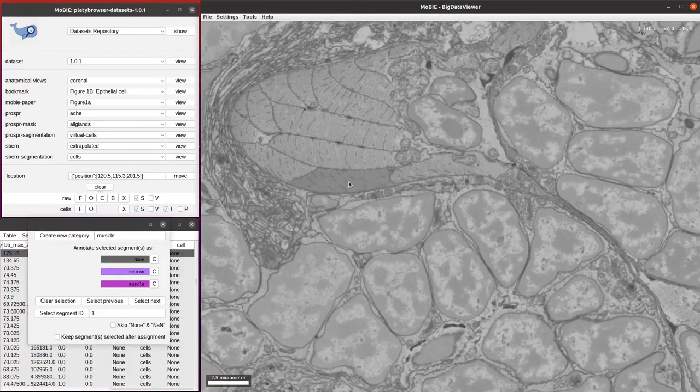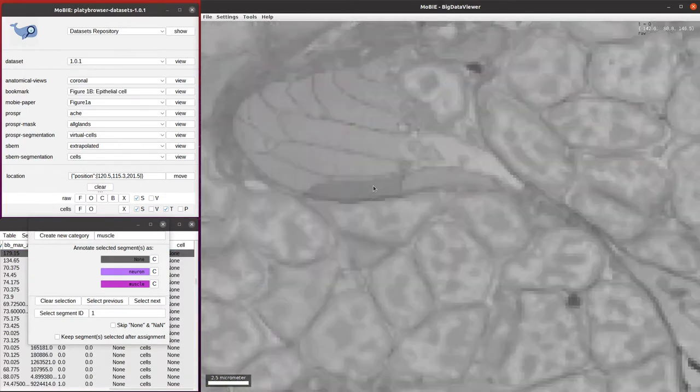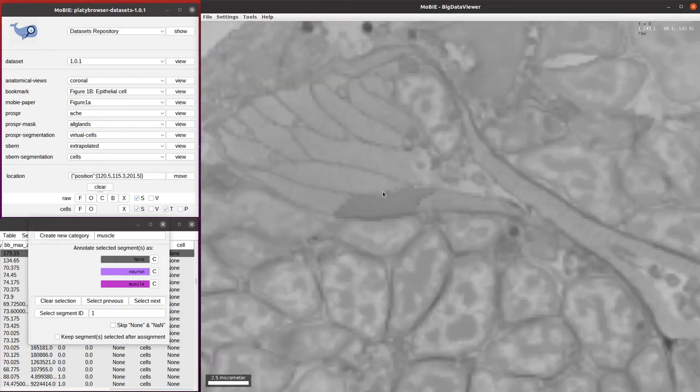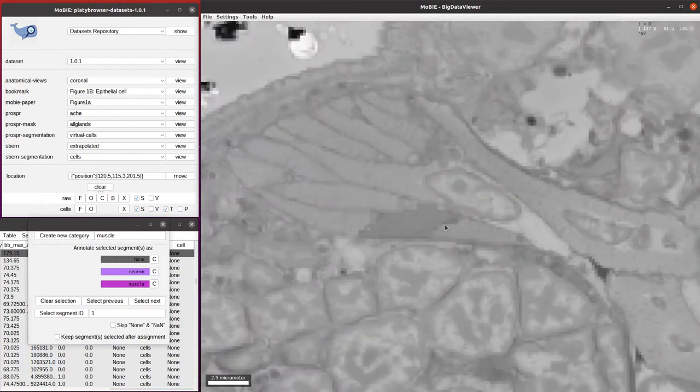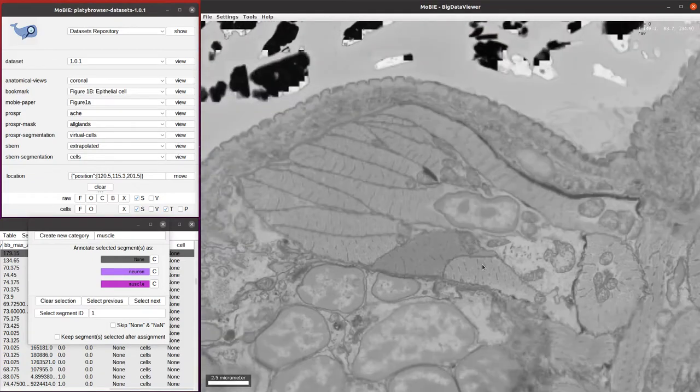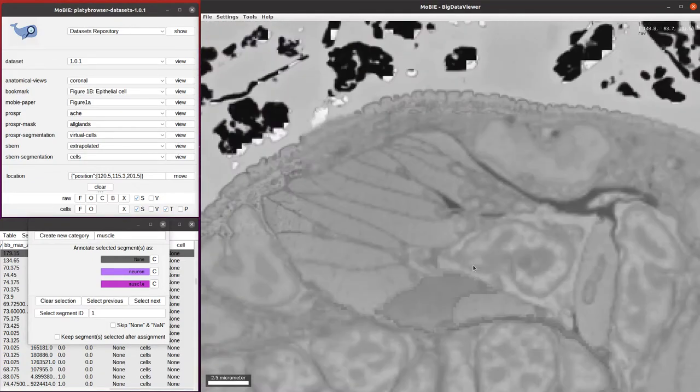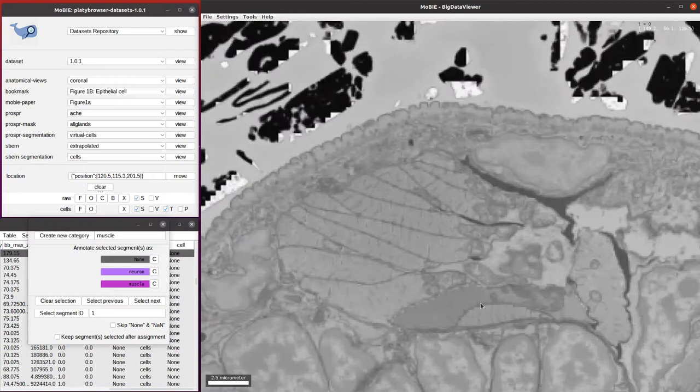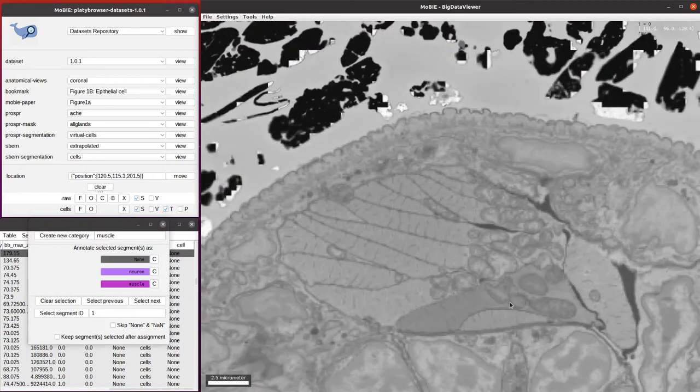If we scroll to another part of the dataset, we see we have a different cell type here. If I scroll through in Z, you can see it's a very long cell, quite a thin cell. We see these black spots inside, which are the individual fibers.